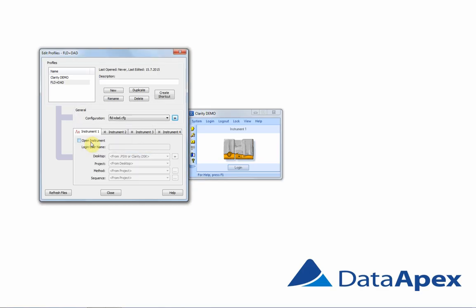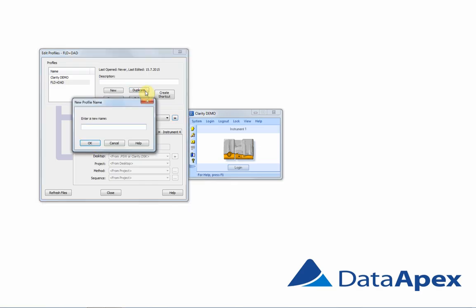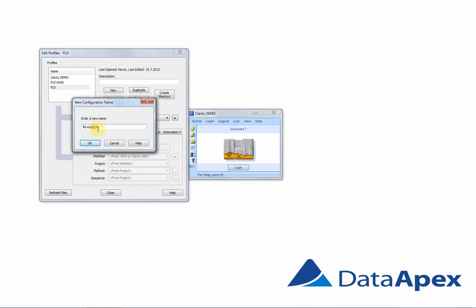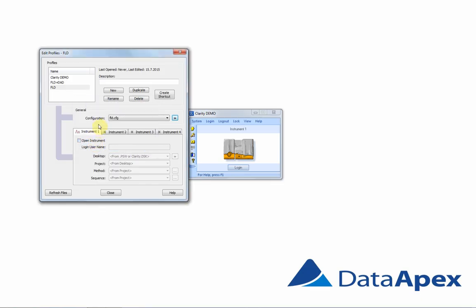The second profile will be using FLD detector only. Therefore, we will create a duplicate of the profile FLD plus DAD and call it FLD. As you can see, the configuration got duplicated as well, but we want it only for the FLD, therefore we will duplicate it again, but this time only for the FLD, and click OK. And this profile is completed as well.